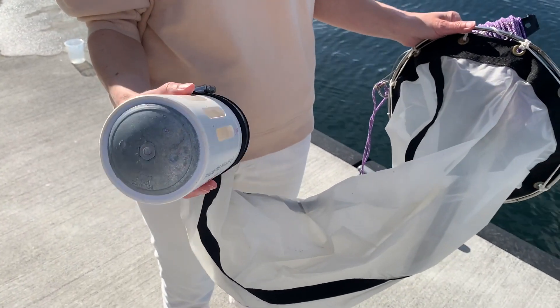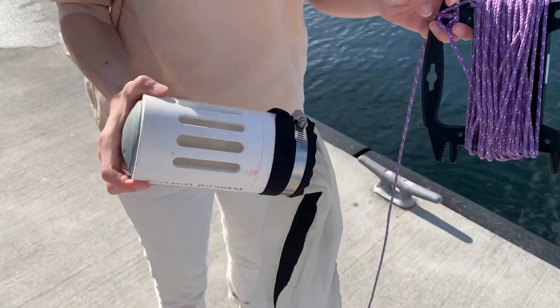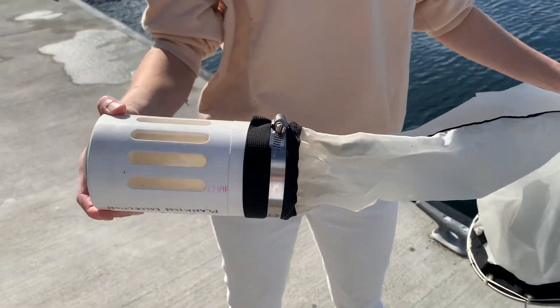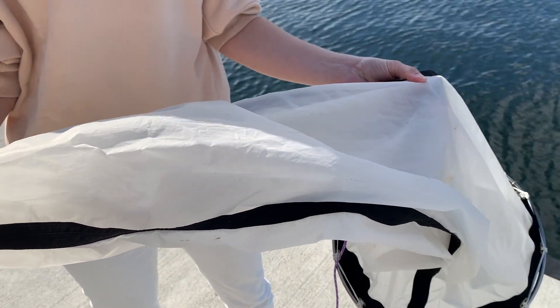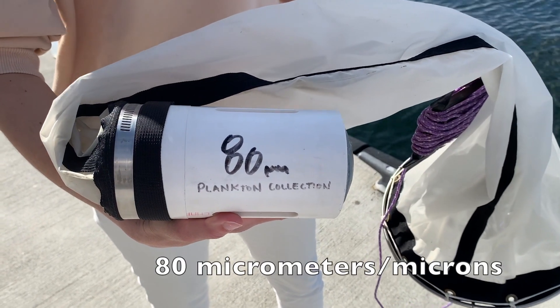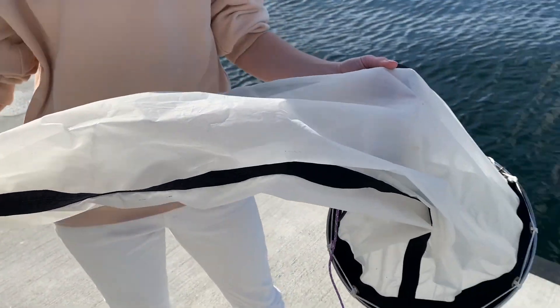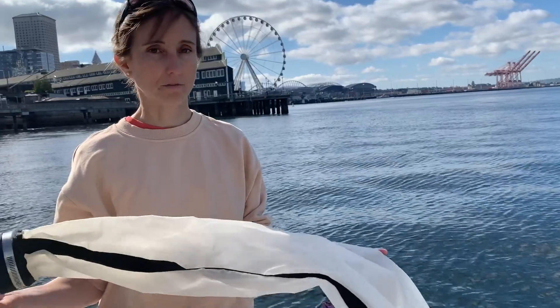This is a very lightweight instrument and if it didn't have a weight it probably would just float at the surface. This end that the weight is attached to is called the cod end, and it gets that name because this net is very similar in many ways to fishing nets. The main body of the net is a fabric — very smooth and soft — because this net has a very small mesh size. We have it written here on the cod end: this mesh is 80 micrometers, or 80 microns. That's a pretty small mesh size, and that means this net is really tailored to catching small phytoplankton, although it will catch anything larger that comes into the net as well. But if we wanted to catch larger organisms it would be better to have a larger mesh size.